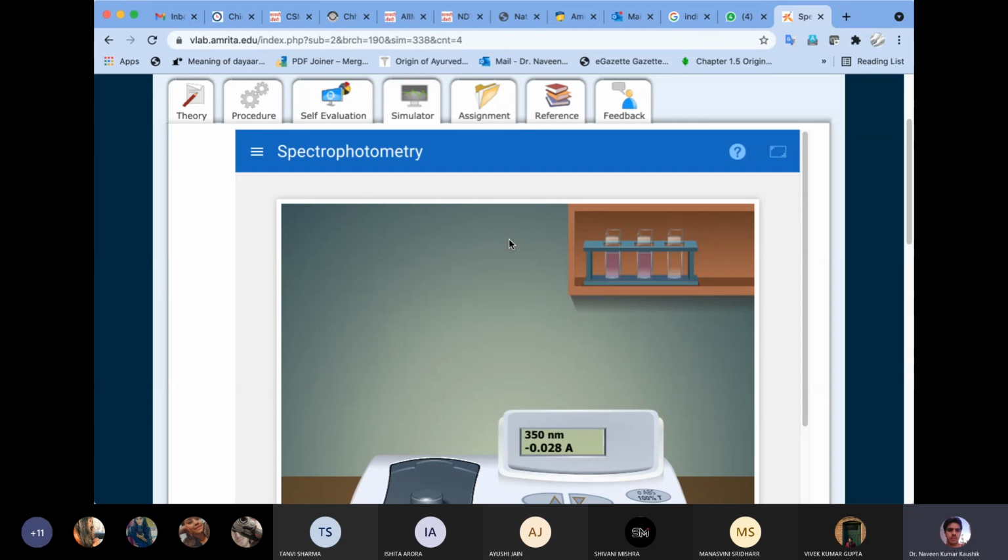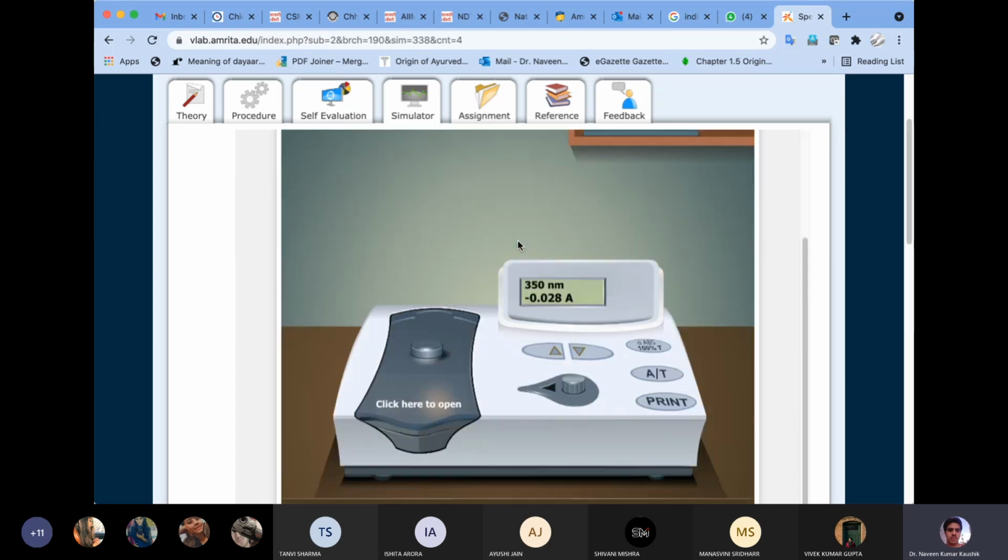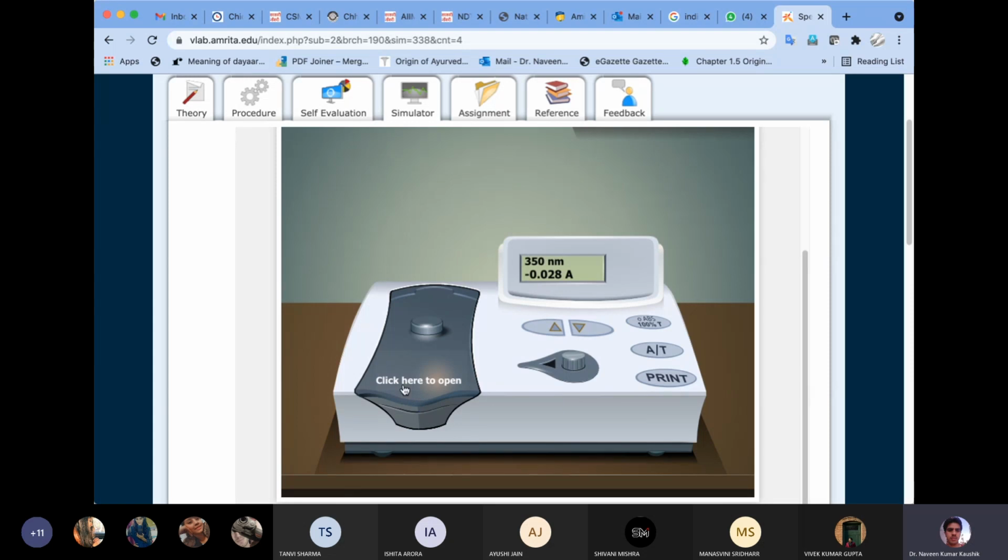When you come to our lab, we are going to have a different type of spectrophotometer. Different companies provide different types of instruments. PerkinElmer is one which provides a very nice spectrophotometer, but other than PerkinElmer, VersaMax is also there. It's not necessary for you to remember, but it's good to know, because in future, if you want to purchase an instrument when you are in a lab, you can choose which good instruments are there. So this is how you quantitate your DNA, and after the quantitation, how you can tell the integrity and the purity of your sample.